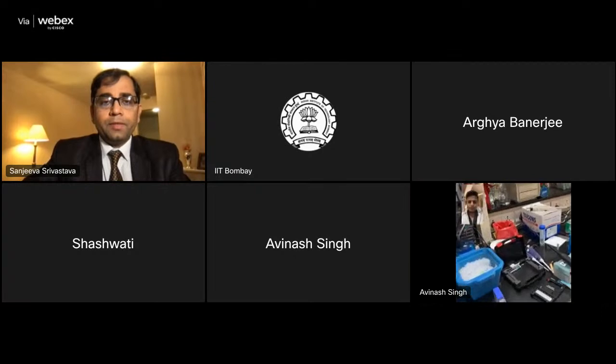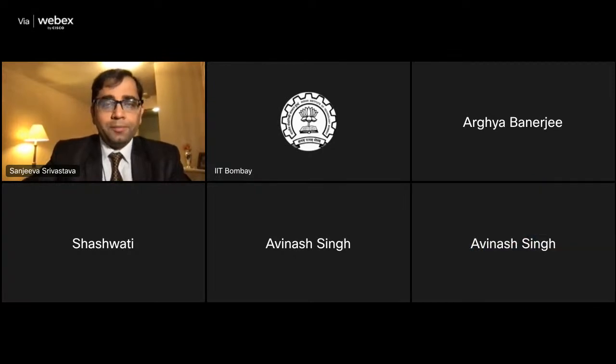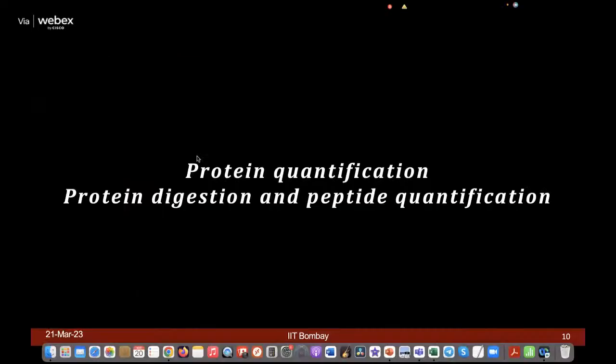All right. Thank you very much, Amrita, for giving this demonstration, as well as Ankit. I think all the students would have realized that, before you actually take the samples forward on the mass spectrometers, you have to do several steps of quality control checks. In a nutshell, you have got a glimpse of these processes of protein quantification, digestion, and peptide quantification.